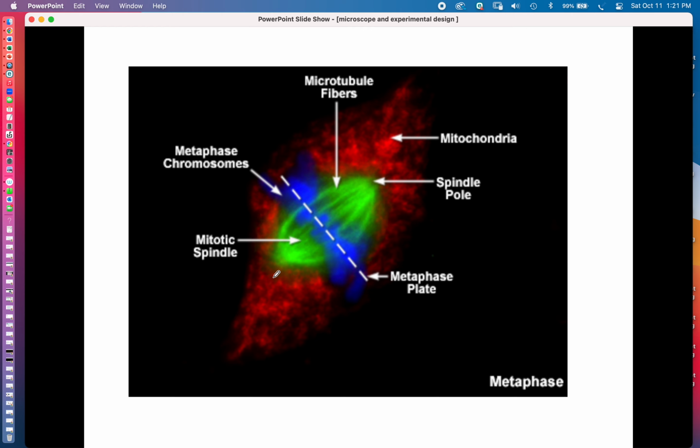And so the trick in fluorescence microscopy is that these pigments can absorb ultraviolet light, and UV light is invisible to our eyes. So the microscope has a light bulb that shines UV light on the sample. That's called the excitation light, and we can't see it. So this sample is actually under a microscope with a really bright light on it, and humans can't see the bright light.